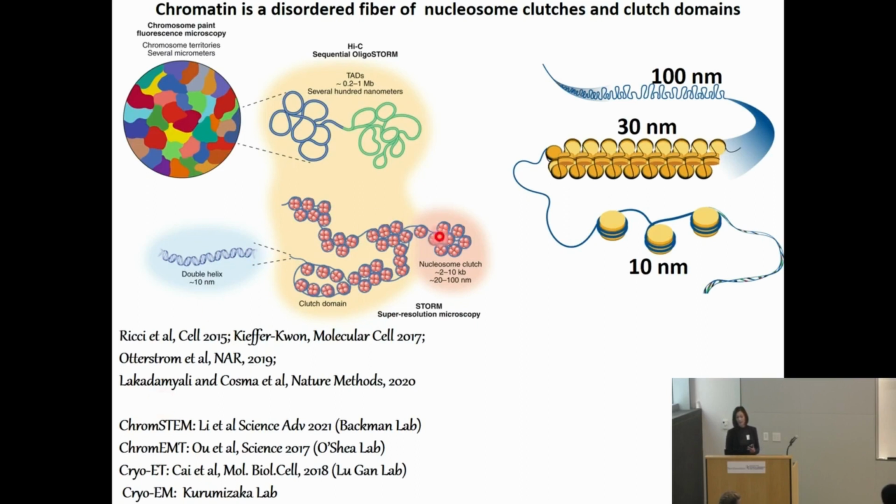And it's composed of these small groups of nucleosomes. Again, we call these nucleosome clutches. Vadim calls them nanoscale packing domains, so they go by different names. But using different approaches, we've settled on a very similar picture of chromatin organization in the nucleus in the form of these nanoscale domains that can be quite heterogeneous.